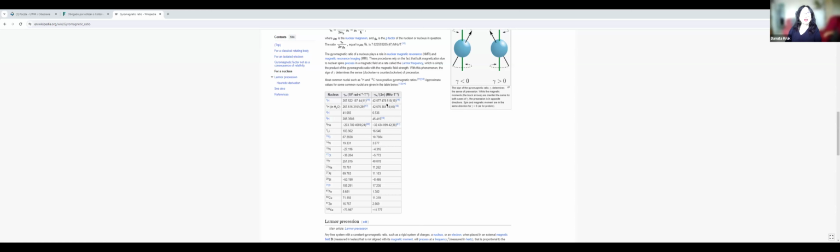Here, look, this is 42.5. I look at fluorine, another quite often present nucleus. It's 40. So you see, here is the largest value, here is the second largest. They are the most prominent nuclei for nuclear magnetic resonance.